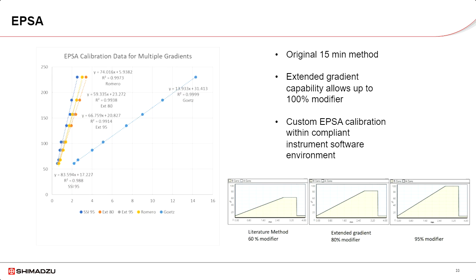EPSA analysis uses a specific chiral selector column along with common pharmaceutical compounds to generate retention times for those compounds, which are assigned an EPSA equivalence value. Once the regression is created between those retention times, the EPSA score or value can be assessed for any cyclic peptide that is injected under the same conditions.